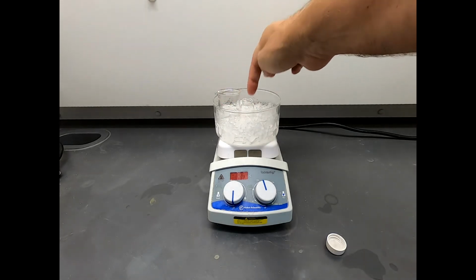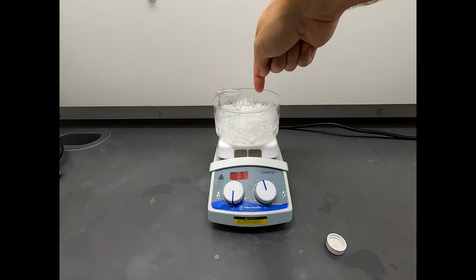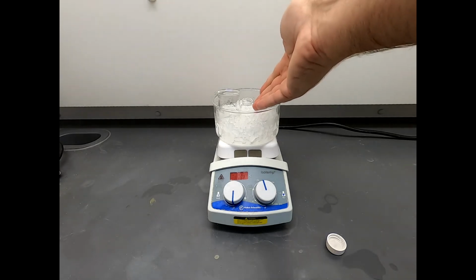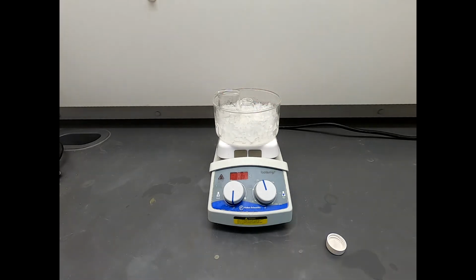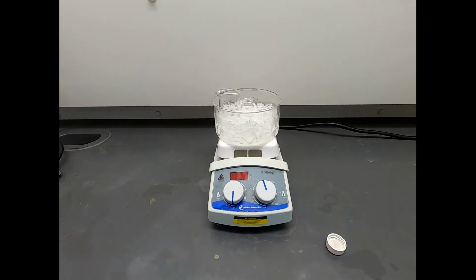We are going to do a filtration of this mixture, and we're going to need some rinse solvent. And ideally, your rinse solvent should match whatever the liquid is in our vial. And that's about 50-50 ethanol water. This should be about 50-50 ethanol water, and it should also be cold. So we'll get that chilling so it's ready for when we need to do the filtration.